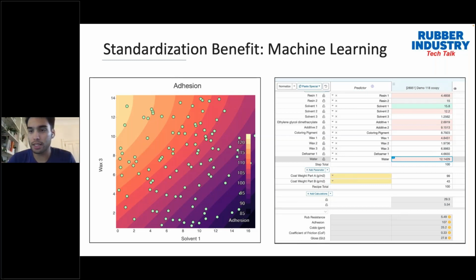The reason I show this as the last piece of the presentation is because the first problem that needs to be solved is, how do we get everybody collaborating in a single source of data entry? How do we get people out of spreadsheets? And how do we get everybody to, like I said, contribute to their organization's machine learning models' understanding of their formulating space?